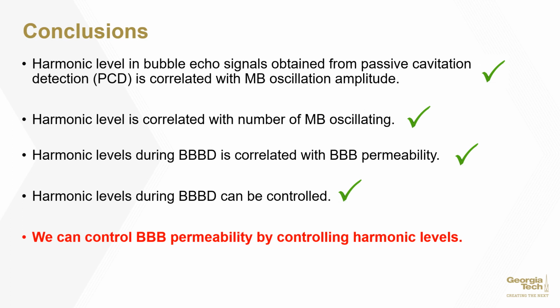And our final question is that since the BBB permeability is correlated to the harmonic level, and the harmonic level can be controlled, can we control BBB permeability by controlling harmonic levels? This hypothesis is currently being investigated and will be our next step.